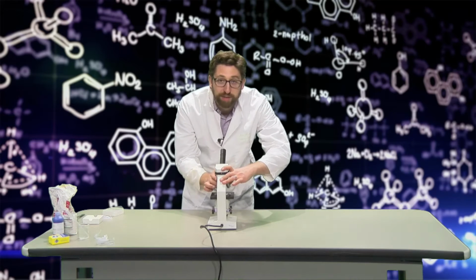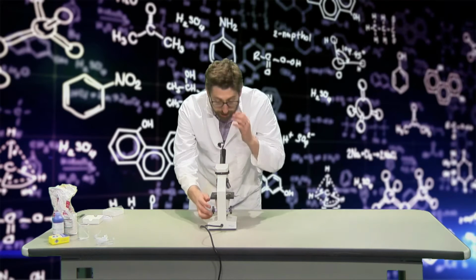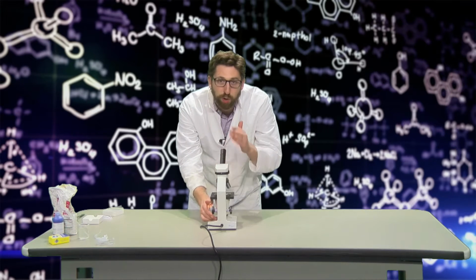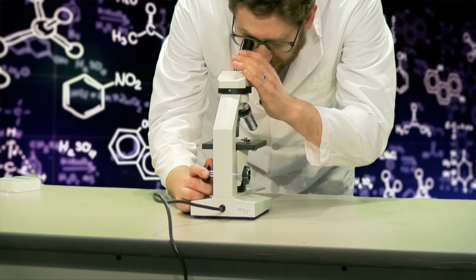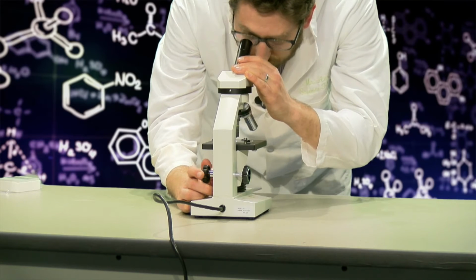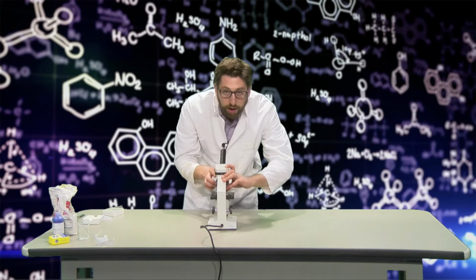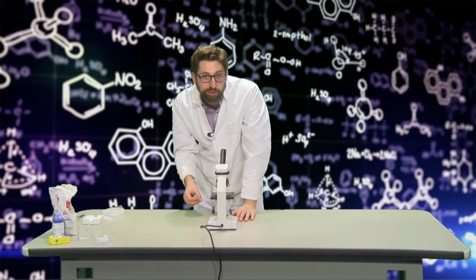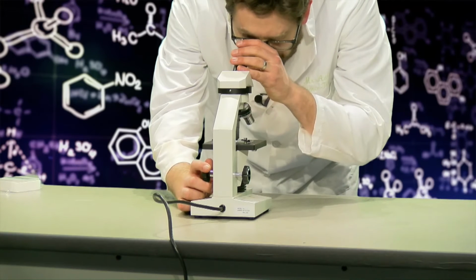Now, if I want to see it even more close up, I can turn to the 10 times objective lens. Now I'm seeing things at 100 times stronger than what I can see with my eyes. Zoom in again. Whoa! I can see those sugar crystals even bigger. One more time, I'm going to zoom into the highest power. Now I'm seeing 400 times stronger than what I can see with my eyes.